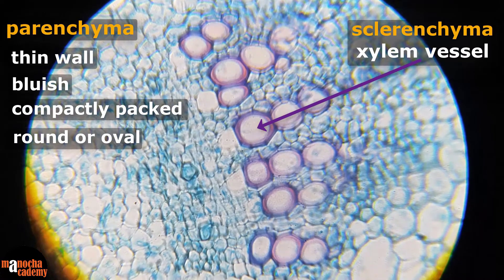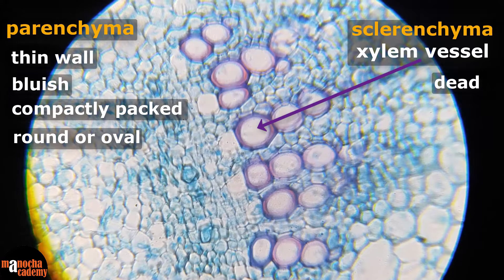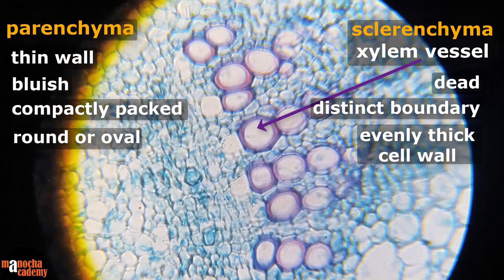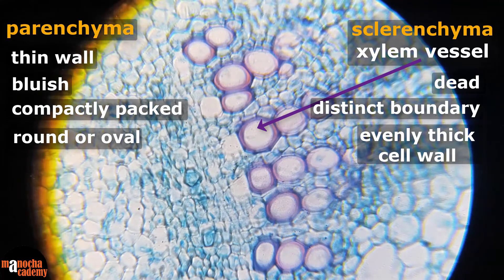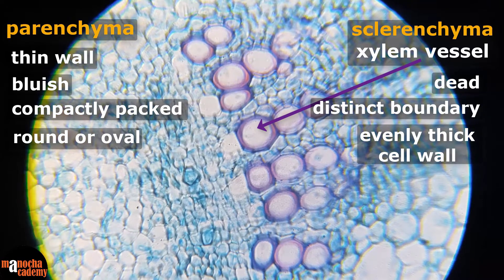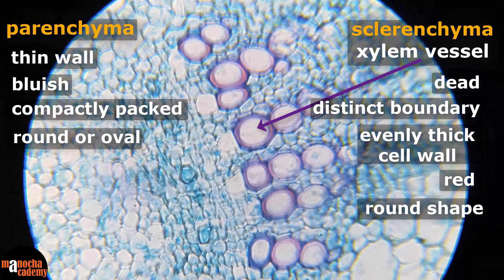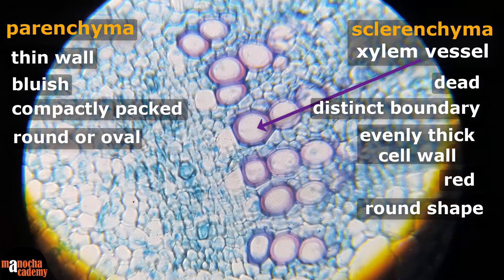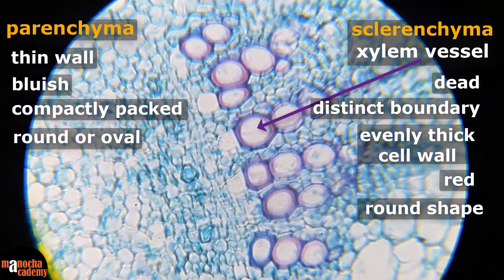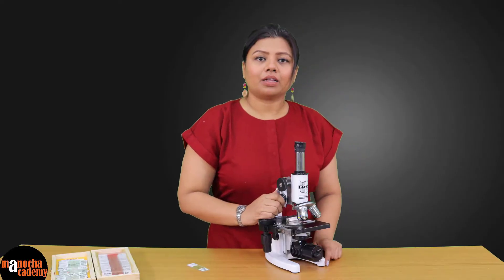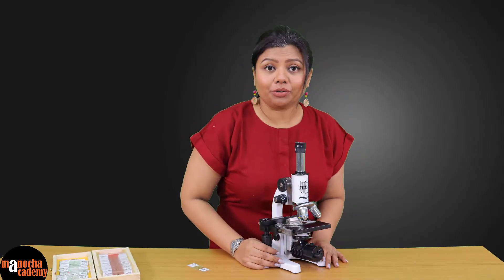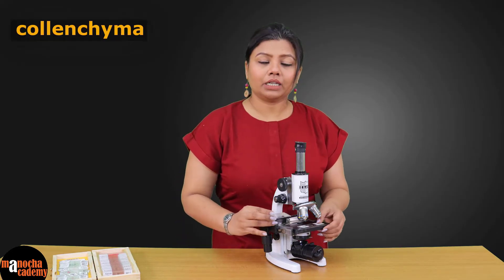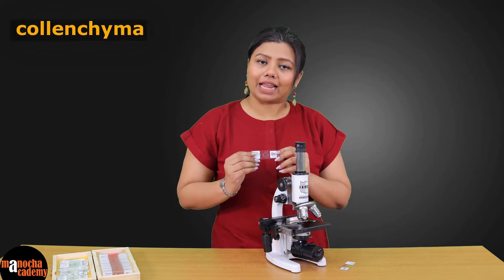Xylem vessels are dead and they have a cell wall which is evenly thickened. Here you will be able to see distinct red round regions, which are basically sclerenchyma cells with an evenly thickened cell wall. Now we move on to colenchyma; we have a prepared slide of colenchyma to focus under the compound microscope.